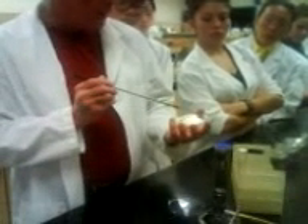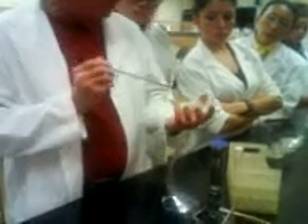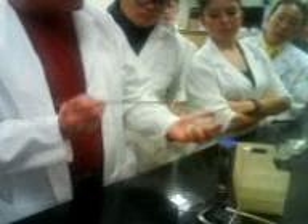In any regard, you've got your inoculum, then you're going to begin your streaking. You're going to start at a shallow angle with the loop flat on the media, and you're just going to carry out your streaks like this. They may not be as straight as I've drawn on the boards — it just depends. You have to pull the plate at an angle to the light so you can see where you're streaking.